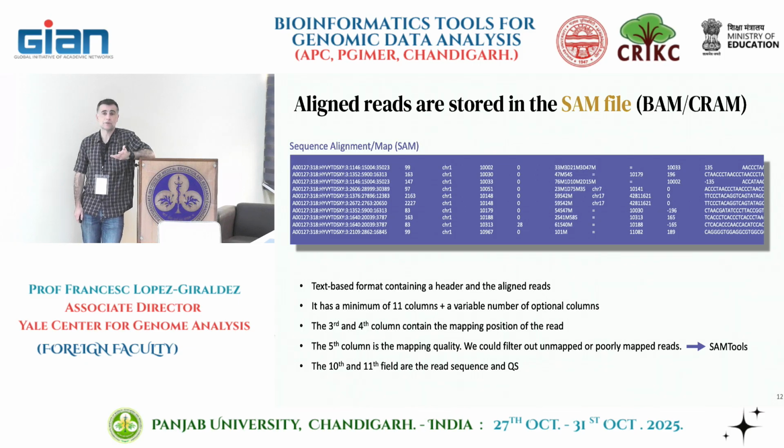But it's generally not a problem, right? You don't care whether the FASTQ file is sorted or not, as long as you're able to recover them. Read one always matches read two in position, right? Some packages, like a Bioconductor package which uses BAM files for ChIP-seq analysis, want a sorted BAM file. Yeah, that's common. A lot of software wants sorted and indexed files. That's something I may talk about later.